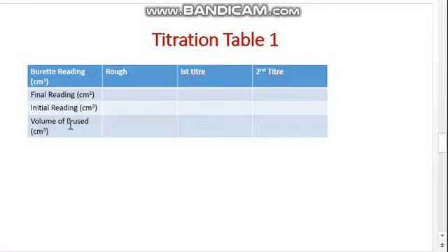This B is the solution that was added in the burette, the solution that was in the burette.